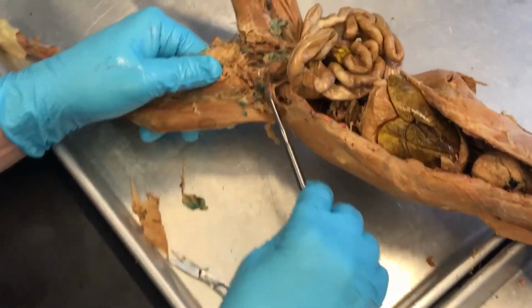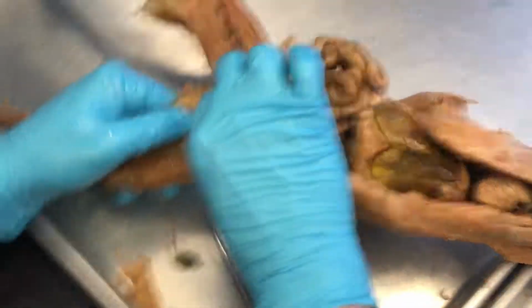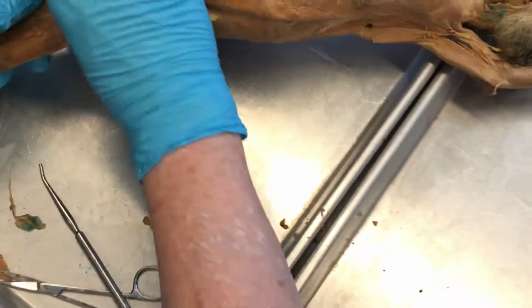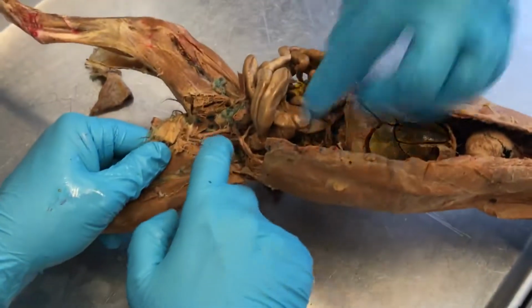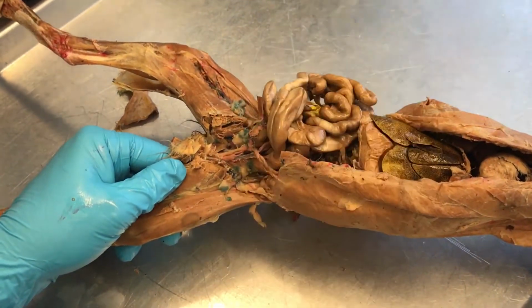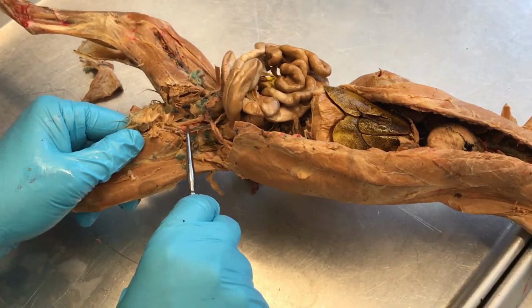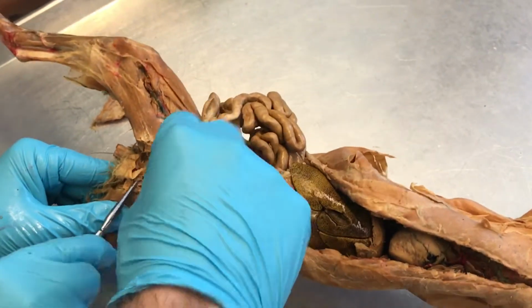Exactly where the uterus ends and the vagina starts is a bit of a, there's a cervix. Who wants to come along and feel where it gets a little bit tighter at the neck? At the end of the veins there. Feels like it's a little harder. Right there is where you begin the vagina, at the cervix of the uterus. Is that this thing?